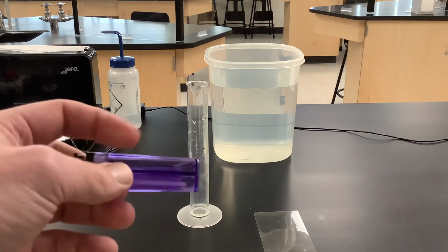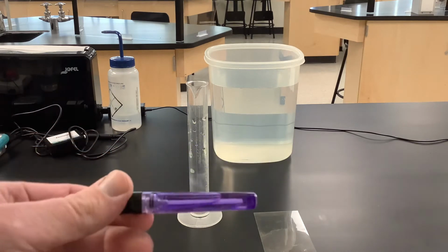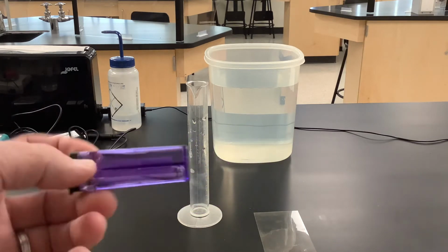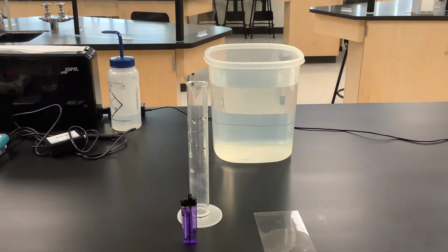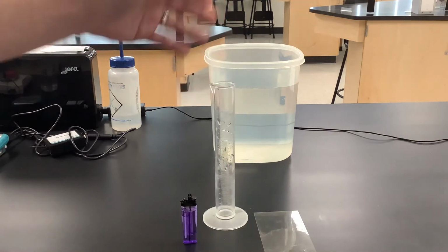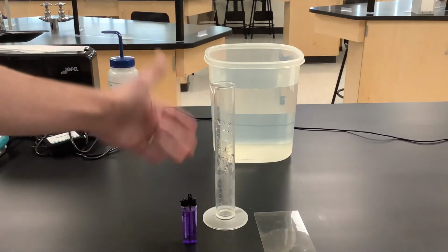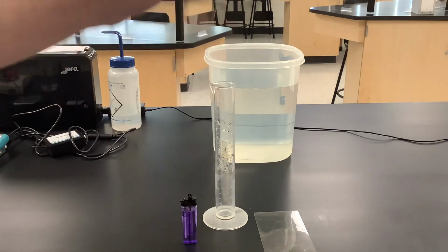So our goal today is to try and find the molar mass of this particular chemical, which we call butane. In order to do this, we are going to collect a sample of that butane and analyze it. I'm going to collect it in a graduated cylinder. However, the graduated cylinder has other air inside of it right now, so it's not going to be a pure sample. So what we need to do is bubble it through water.